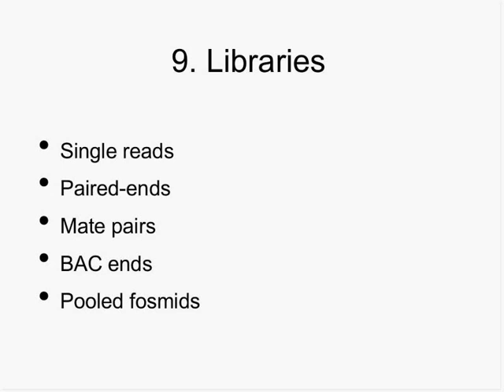They take a whole bunch of different library preparation methods and then put them into the same assembler. They recognize how important it is to have the libraries made well, and so that's why they would want to see that. It's not really appreciated all the time how hard it is to make the libraries, so a lot of effort can be spent there.